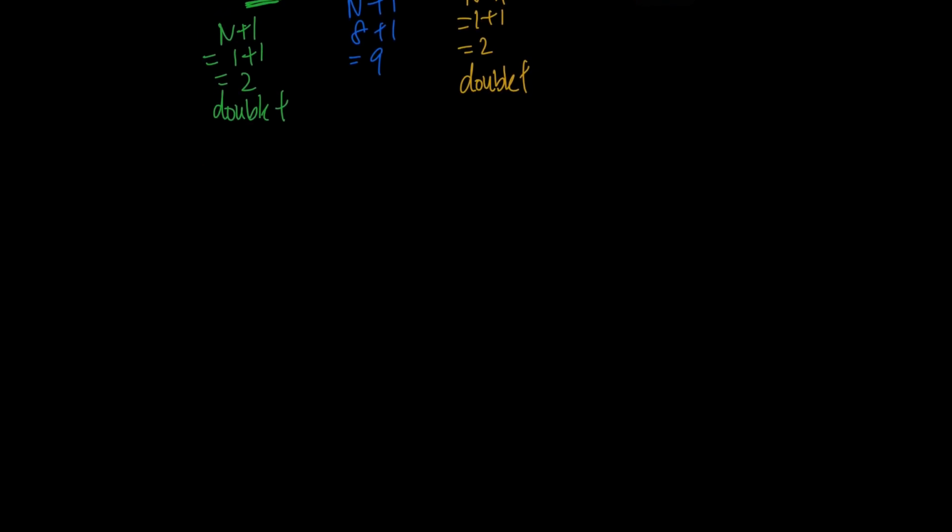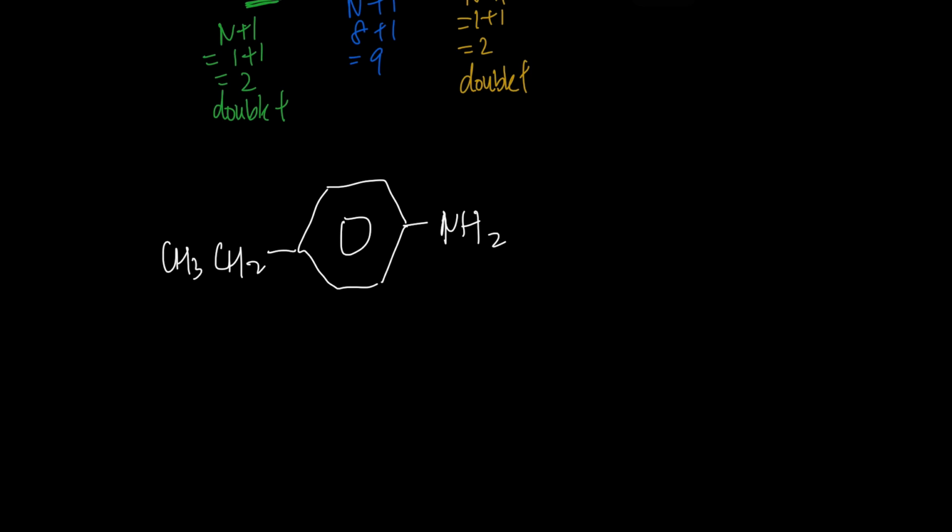Let's look at the last example, an aromatic compound. CH3, CH2. I hope you still remember how to determine the number of signals.